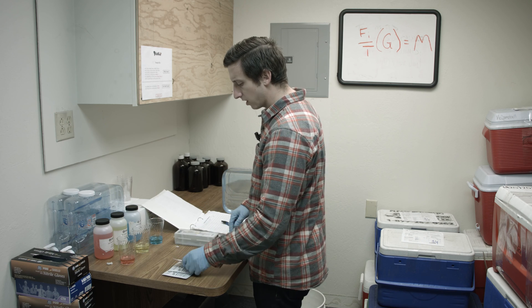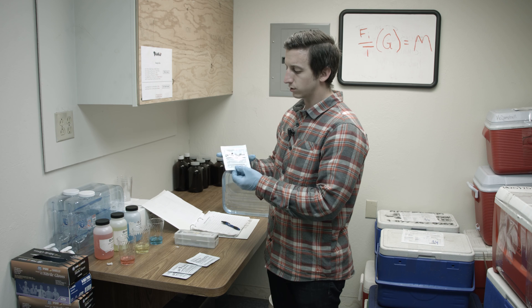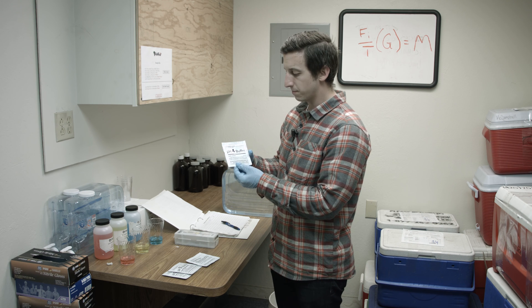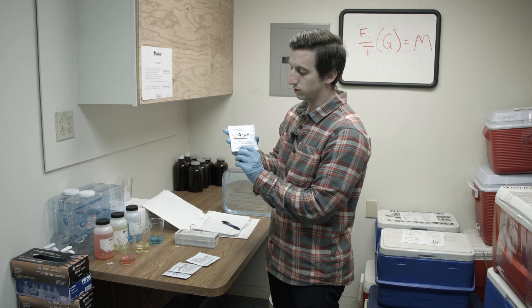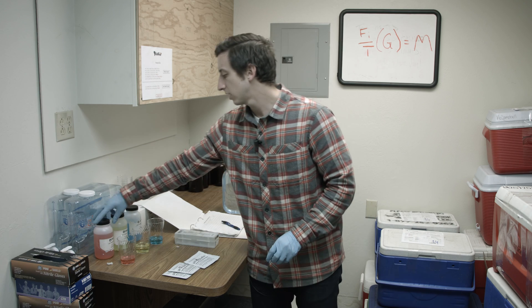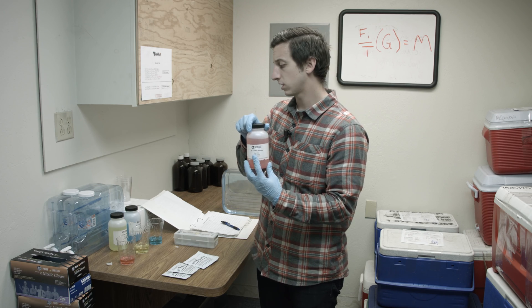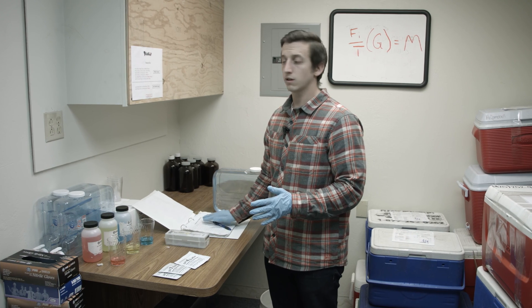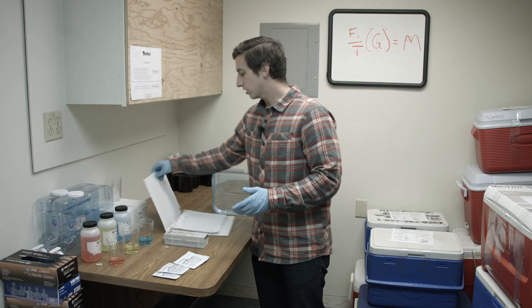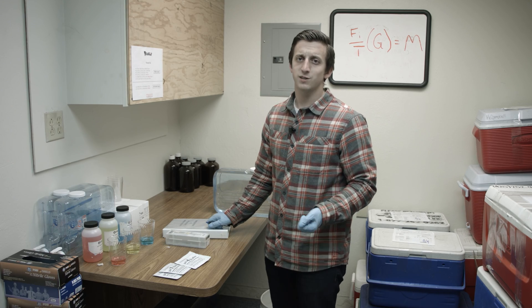A general tip: when performing calibrations, make sure your solution packets are not expired. You can see the expiration date right here — this one says 7 of 2016 and this one also expires in 7 of 2016. Ensure that you have non-expired materials and make sure you're writing everything down in your calibration logs. That's everything you need to know about how to do a three-point calibration for your pH pen.